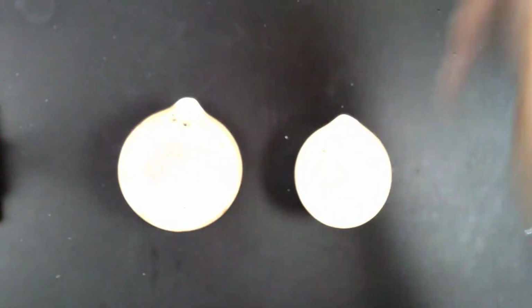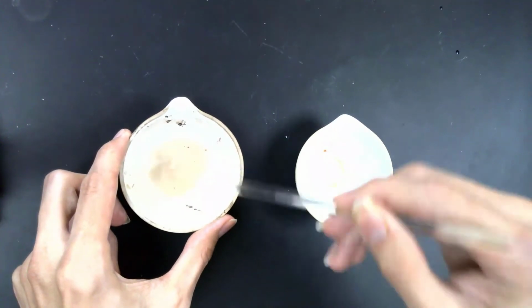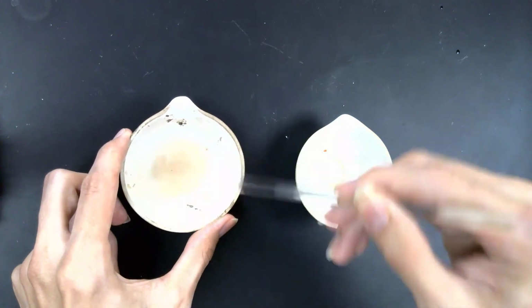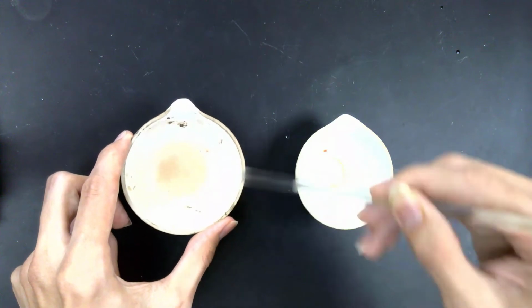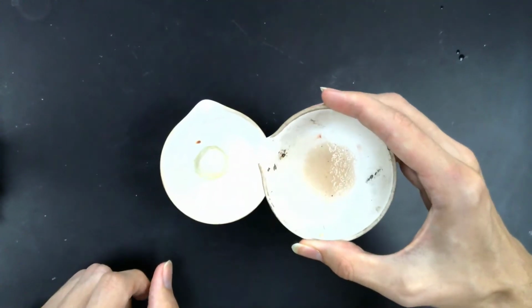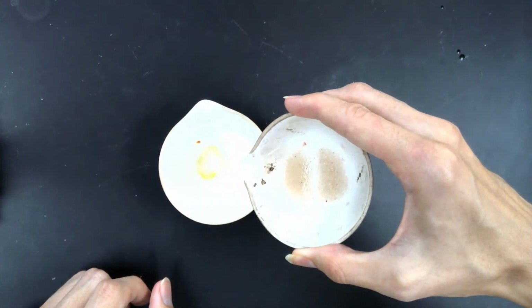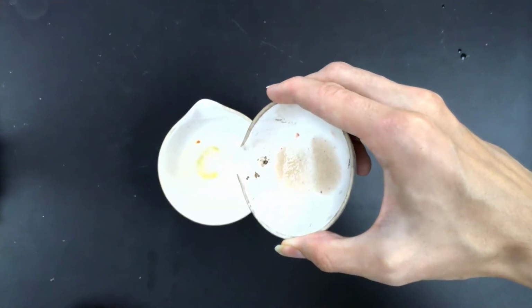Okay. Let's stir it a little bit to get as much of the salt as possible into solution. Okay, and now I'm just going to decant. So to do that, pour off the water, try not to get any sand. Slowly decant all the water with the salt in it off of the bed of sand.